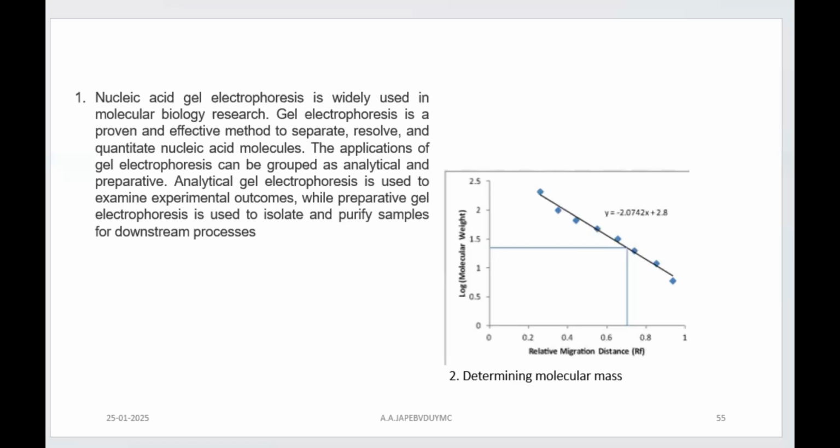So you can find out the molecular weight of many proteins. I mean, it has been determined using this method, right? It is a very simple method. Reproducible results are there. It is very easy to construct and interpret the results, right? So when it comes to electrophoresis, this was the first lecture to summarize some of the applications of the electrophoresis technique.